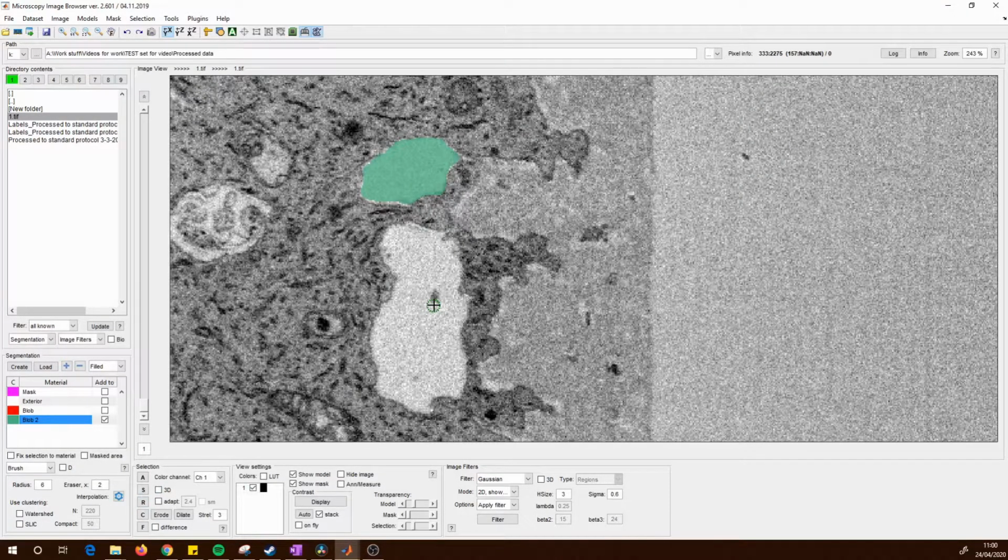I'm not going to go into massive detail right now about how all of these features are useful and what situations you use them in. I'm just going to teach you the basics, and hopefully you'll be able to go on and expand on that yourself by trying out some of the tools and using the selection and segmentation tools.